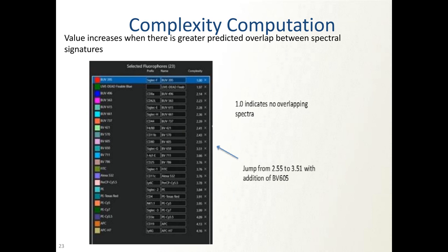Okay, so once we have all this plugged in the system, the next step is we run all the controls. And as we run these controls, it's just a simple matter of running, in this case, beads and then cells for the live dead. It basically said, this is a good control, there's enough positive, boom, and we'll do that. And it goes through and adds it into its little calculation and tells you a green check mark or a yellow warning or a red, no, that's not working.